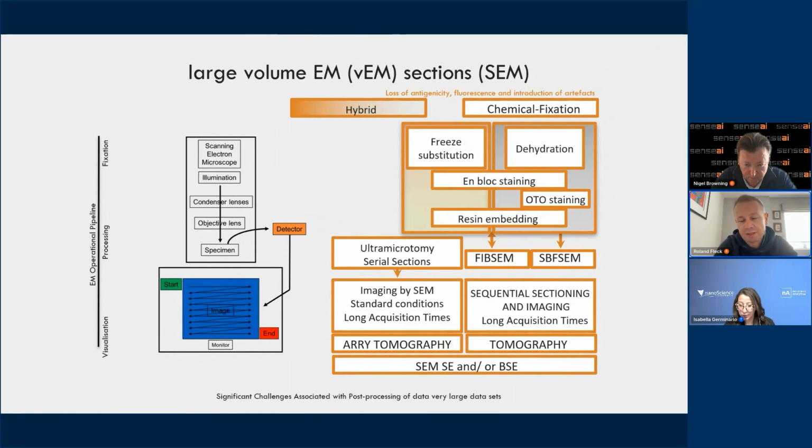So essentially, electron microscopy allows you to achieve higher resolution data than you would with perhaps light microscopy, simply due to the wavelength of the imaging source. But normally we're quite limited in terms of the field of view and the thickness of the sample. So that's generally considered the biggest limitation or weakness of electron microscopy. So volume electron microscopy essentially brings together a group of different techniques which allow you to generate electron microscopy level resolution, but over large X, Y, Z volumes.